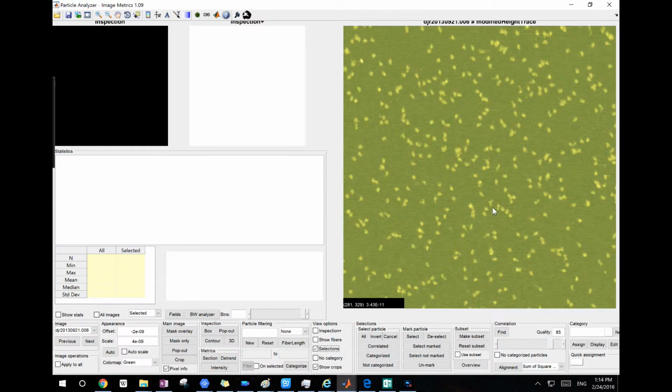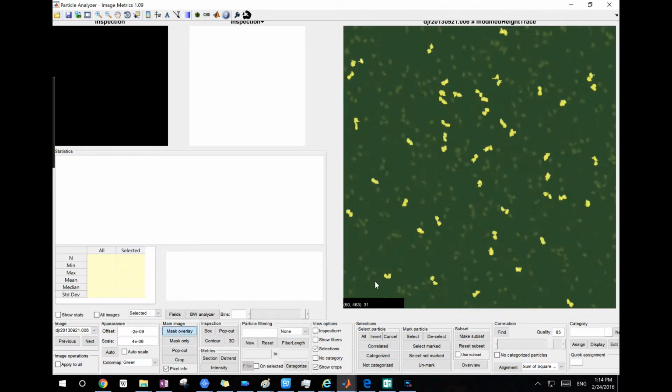So in order to align these particles, we want to have a template first. Right now, I didn't analyze all these particles. Instead, I picked those larger ones as highlighted in this figure. So I can pick the ones that are highlighted, but not the ones that are not highlighted, because they are not analyzed. In this image, I want to analyze those larger particles, proteins, dimerized proteins.